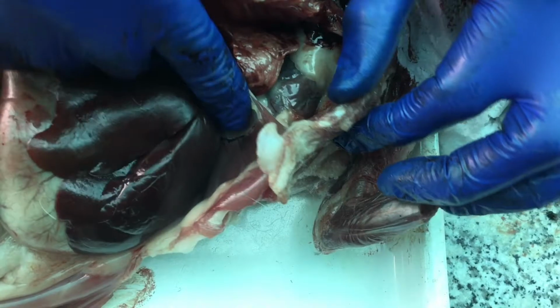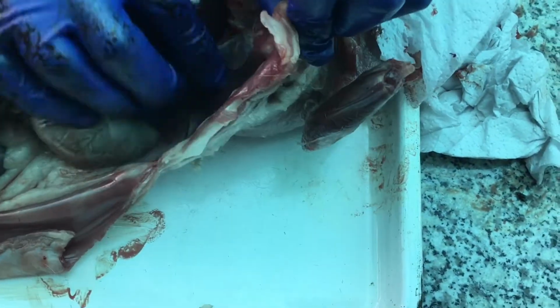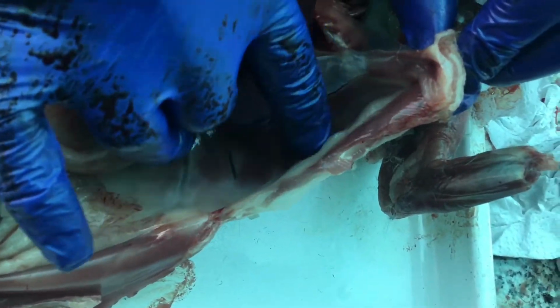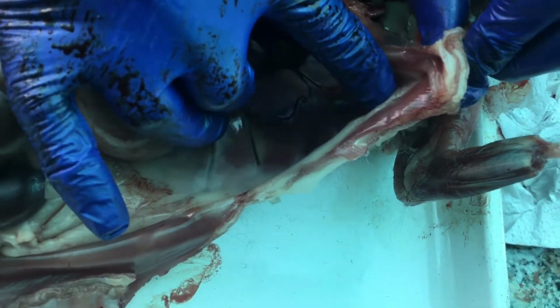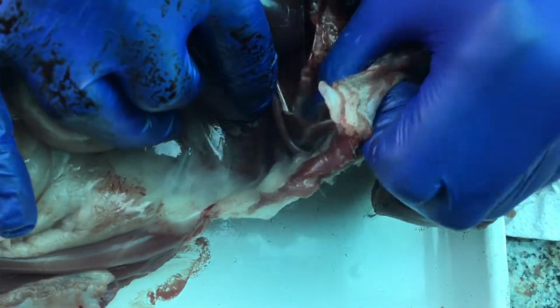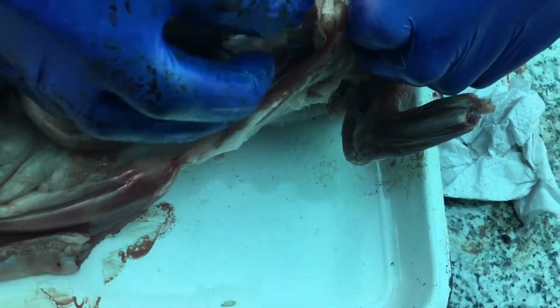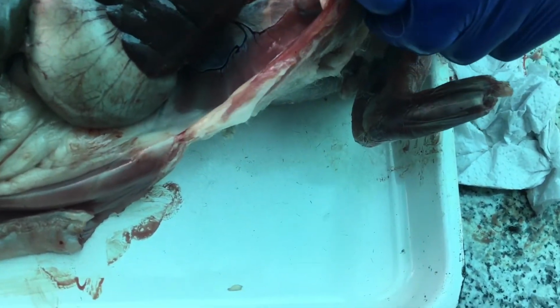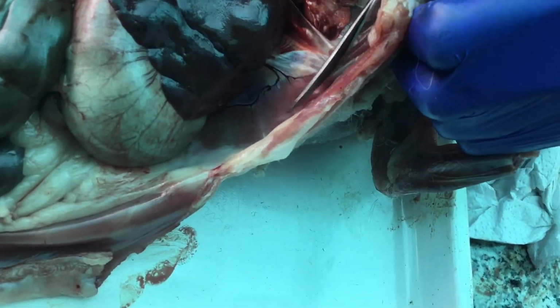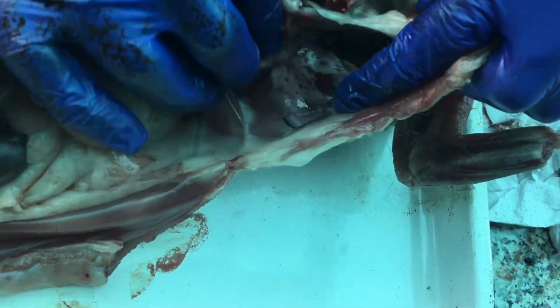And in order to see into the other side of the chest, what do I have to do? Here's my liver, I'm looking in from the abdomen, and there's the left side where the diaphragm connects to the undersurface of the ribs. Again, the diaphragm is just that thin muscular layer that when it contracts, when those muscles pull inferiorly, they suck air into the lungs. If I just cut along the inner surface of the ribs over here, now I'm going to be able to look up into the chest cavity on the left side.